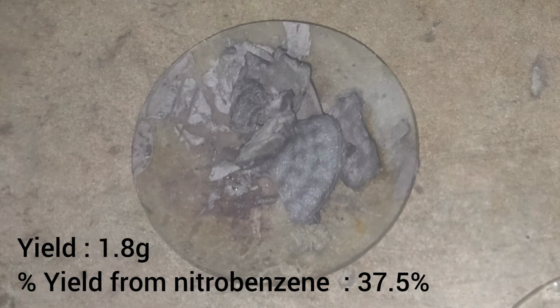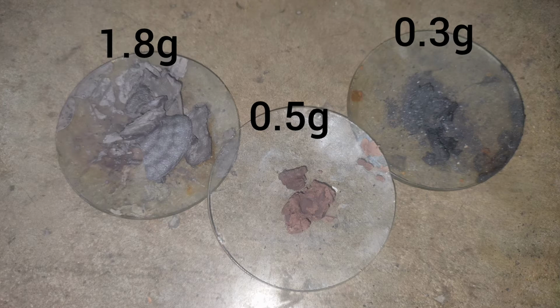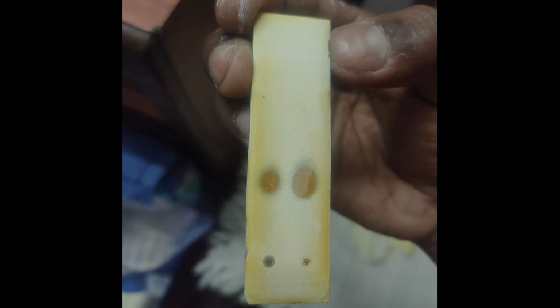The final yield of benzidine was 1.8 grams, which corresponds to a percentage yield of 37.5%. On the left is 1.8 gram of benzidine prepared by this method. In the middle is 0.5 gram of benzidine prepared from the dithionite method. It looks a bit different in color, and on the right is 0.3 gram of benzidine which was prepared by Devarda's alloy. I checked the TLC of the left and the middle compound and found that both had the same Rf values, meaning that both are the same compound.